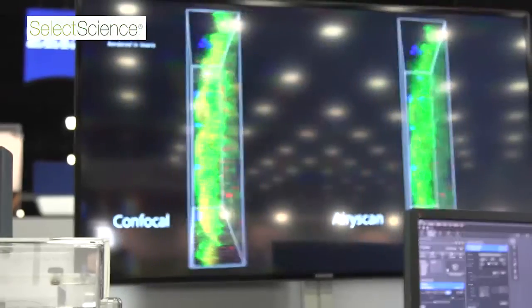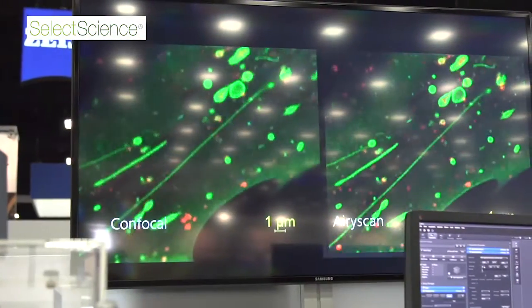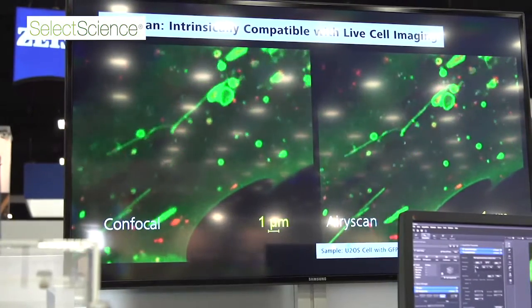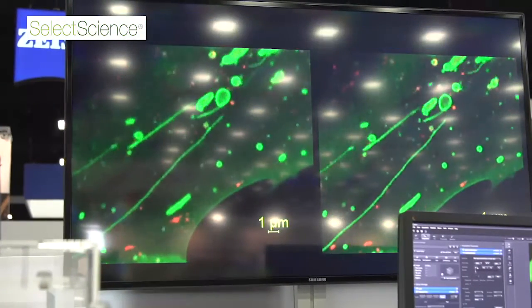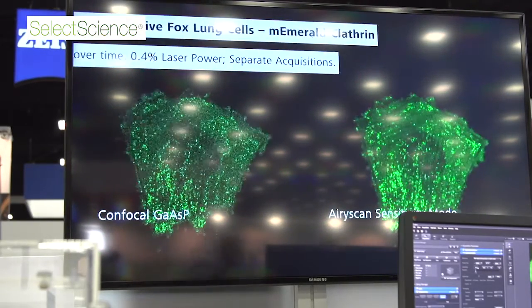For live cell imaging, this means you can image your cells for longer periods of time, do extended time lapses in super-resolution, and capture dynamic events like calcium imaging and vesicle trafficking over extended periods without bleaching or frying your samples.